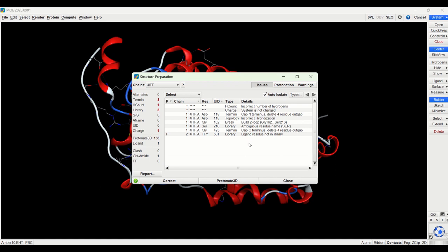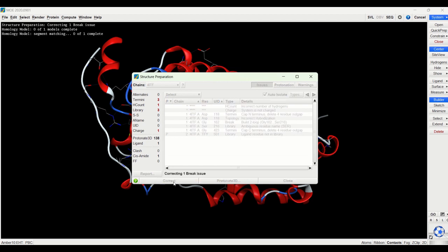And here is basically a list of it shows you everything that is found that is incorrect in this protein. So for instance, it found an incorrect number of hydrogens. So all we do here is click correct, and it will go through that list and correct all the errors that it finds in the protein.